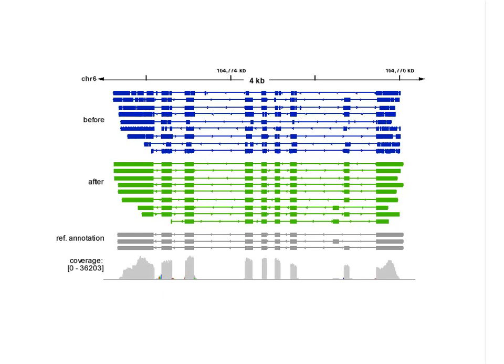Is it implied that the user sequence his or her genome, the genome under investigation, on both PacBio and Illumina before assembly? Or by short reads, do you mean short reads that are produced by the PacBio instrument? It can be either way. So we're agnostic to the single molecule technology, so we could use PacBio or we could use a future technology like Nanopore.